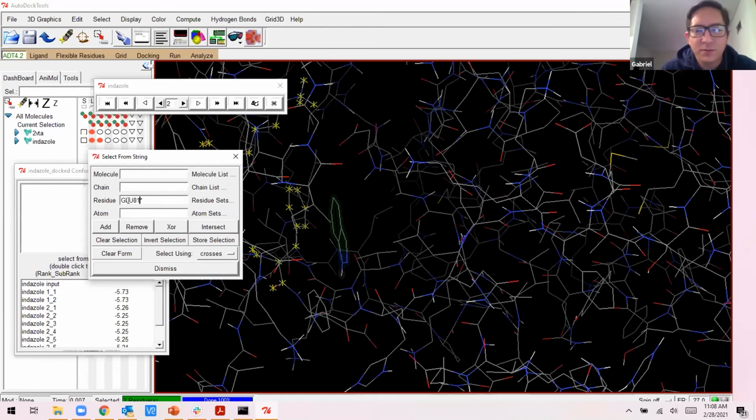GLU 81. Add it, it is there. For phenylalanine 82, PHE, add. Now I'm going to do it for leucine 83, LEU, add. Histidine 84, HIS 84, add.